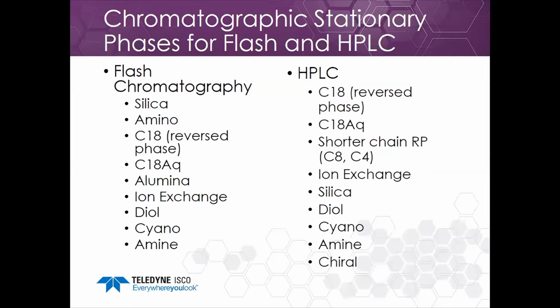So there are more media for HPLC that may be useful for gaining resolution and separating chiral compounds.